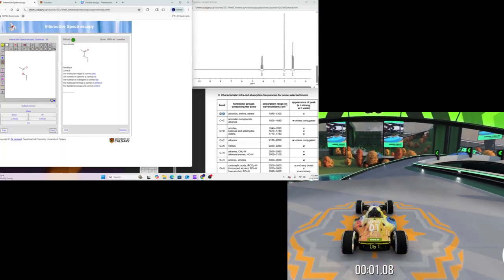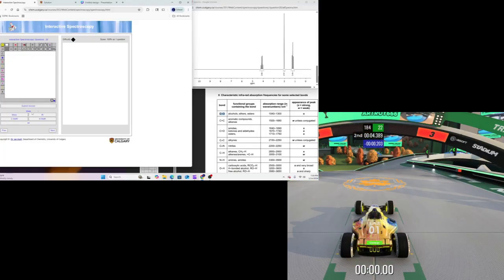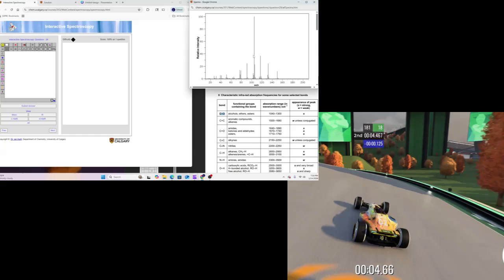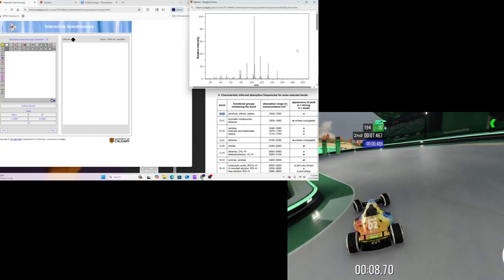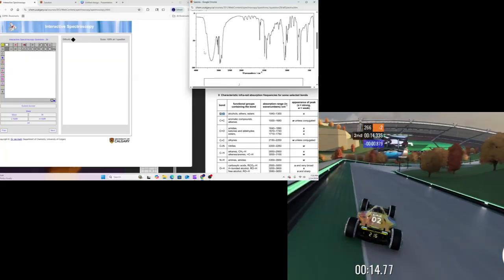So we're going to go ahead and shoot ahead here to another great example. That's going to be number 29 here. Okay, and I'm going to click all here so that I get them all right here. And we see that we have a fairly large one here, but it's not going to really affect us as much as we think. Okay, now this one here shows us a new group right here.